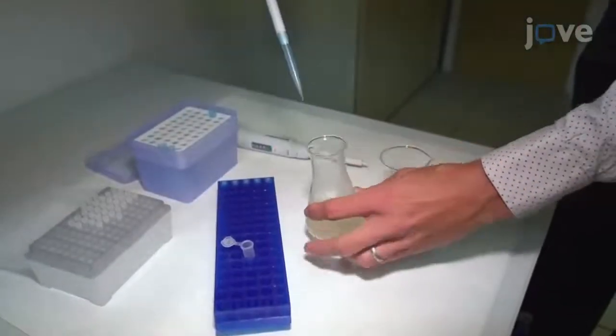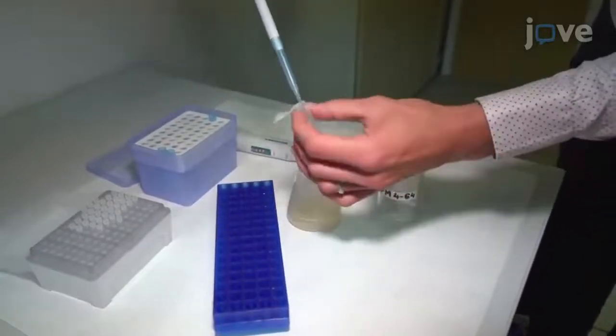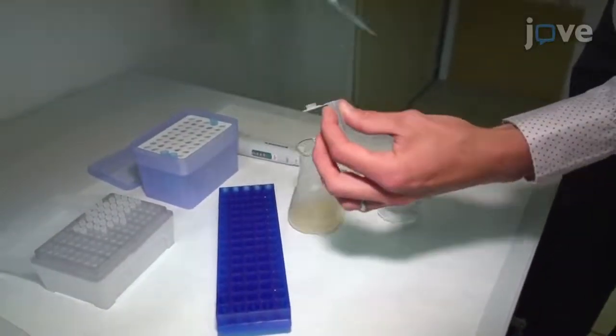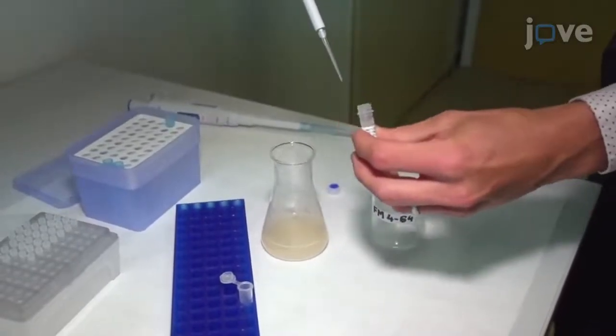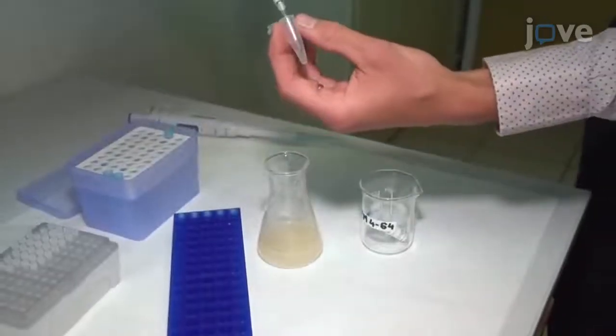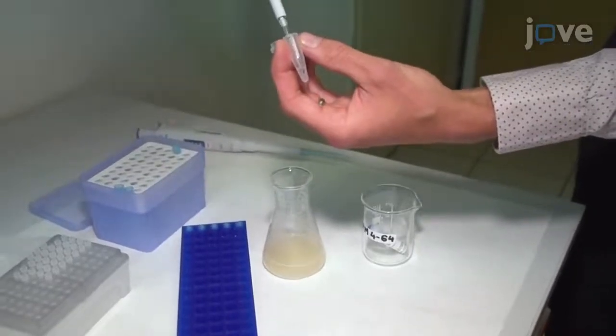For tobacco BY2 cells, stain 200 microliters of cell suspension with 0.2 microliters of 10 millimolar FM464 solution in dimethyl sulfoxide.